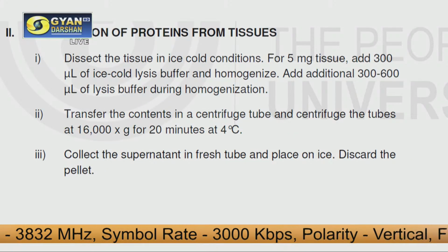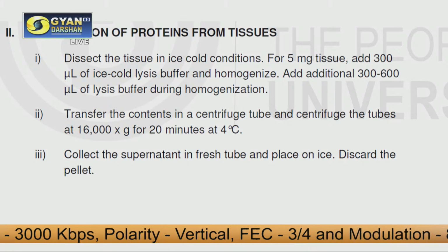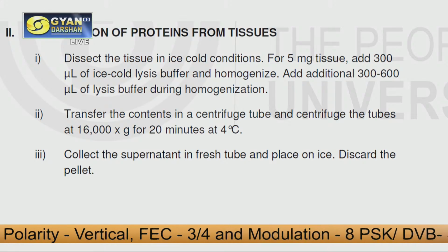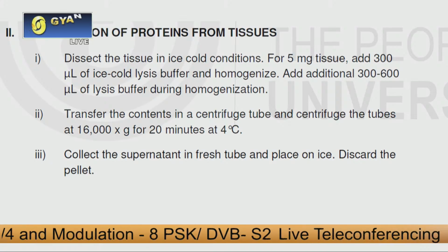Or let's say you are extracting the proteins from tissues. Then you have to dissect the tissue, and follow the same procedure: add the homogenization buffer and the lysis buffer, centrifuge it, collect the supernatant, and discard the pellet.